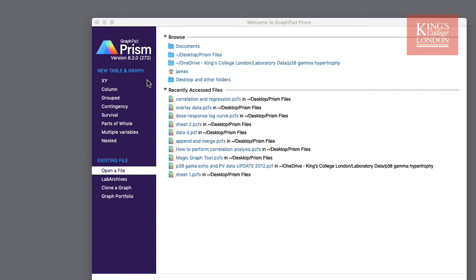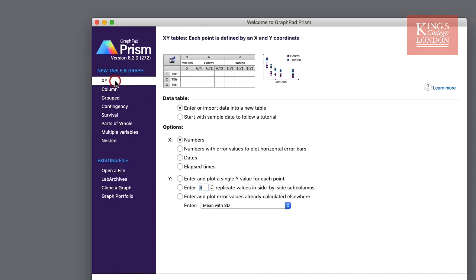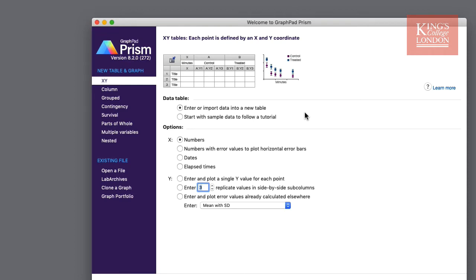When selecting any one of these, we'll select XY, you'll be presented with a window in which you can choose options for your data table and data input. A useful Prism feature is that at the top of this page you can both see an example of the data table and a graph shown. Underneath this you have a choice whether you are going to enter or import your own data or start with sample data to follow a tutorial.